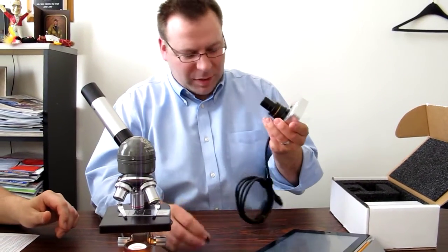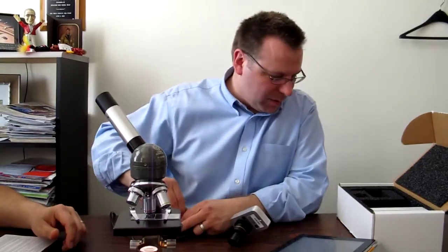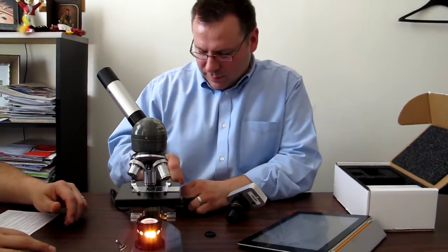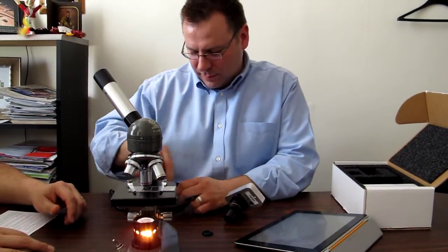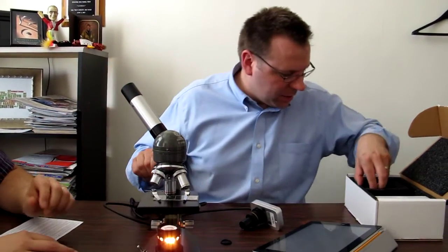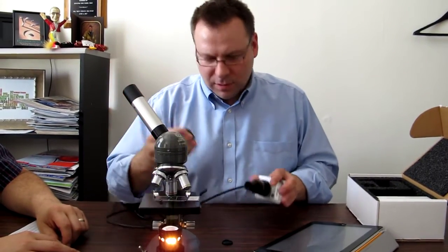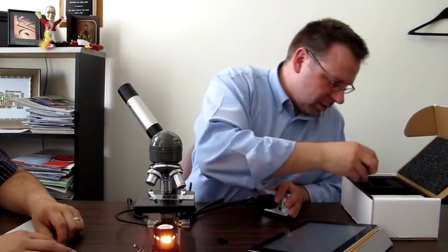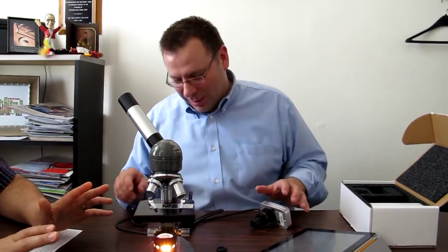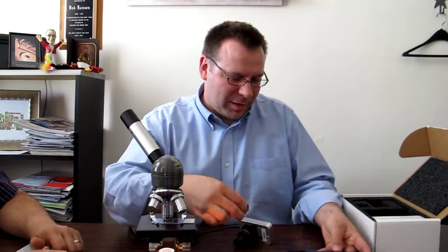Okay, so it'll replace the eyepiece it looks like. Okay, so first of all let's see what happens when we... Now this is going to slide out. Well there's an adapter here too. So let's see... Directions would be helpful here but this is very biology like for me.